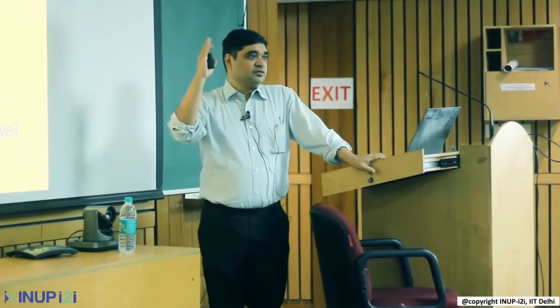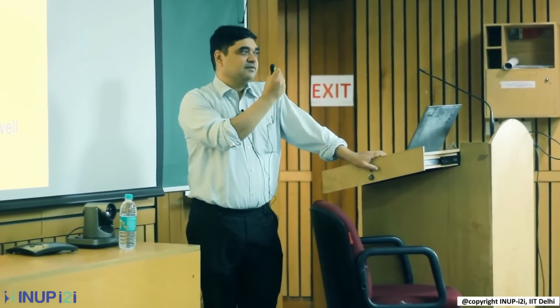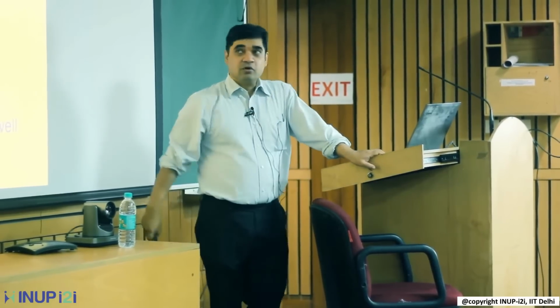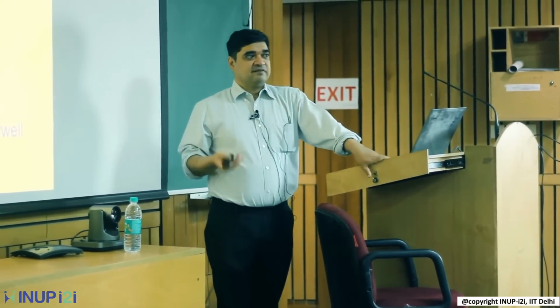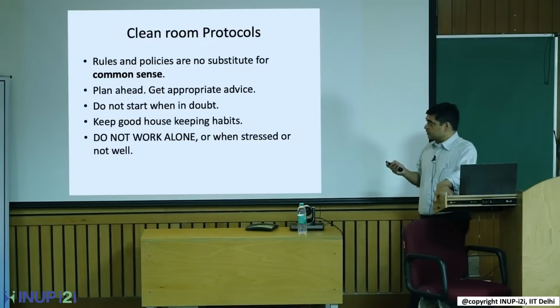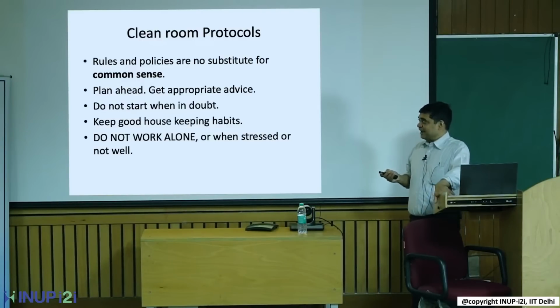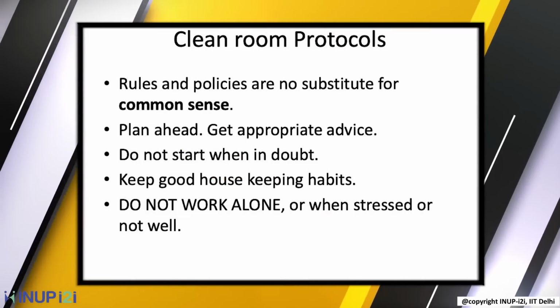The reason I am explaining the principle of these things is because I cannot make enough rules, right? Some things are common sense. You don't hold a wafer in front of you and blow on it. Some of these come from your intuition. You have to understand what you are doing and why you are doing it, so that you can do repeatable research. Don't plan to go there and figure out what you'll do. You'll have to plan ahead.